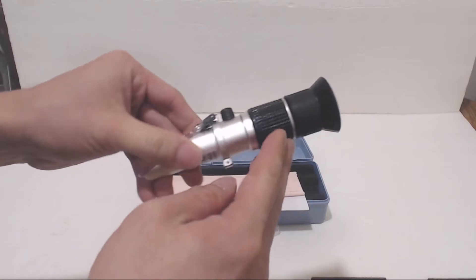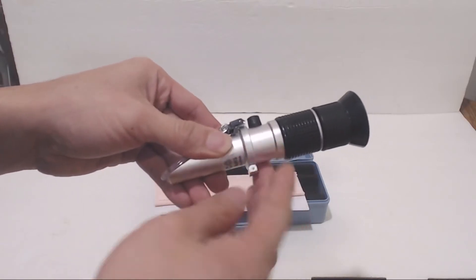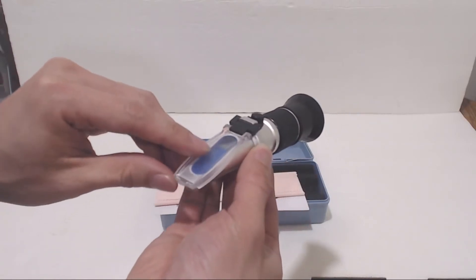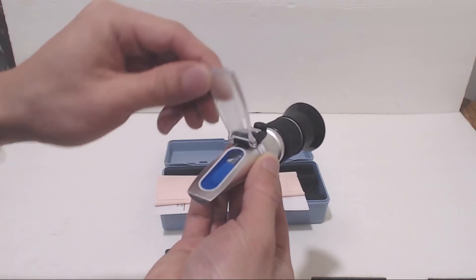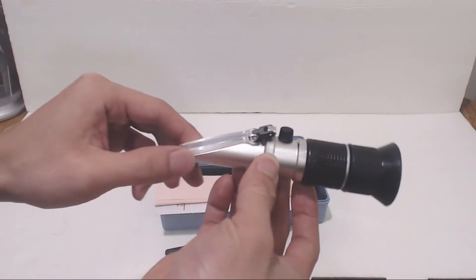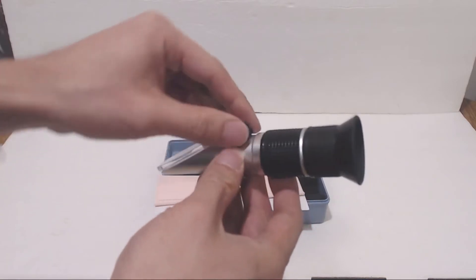The tool consists of an eye cup, the main body, which is made of machined aluminum, and a prism, where you add the sample to be measured. There is a plastic plate here on a hinge that compresses the sample against the prism and a calibration screw under this rubber door.